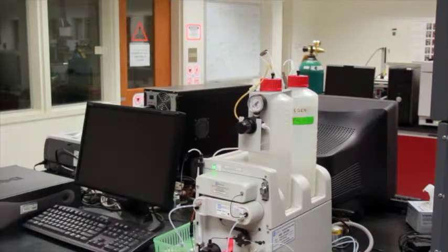When we're getting the instrument ready and getting it started, you want to make sure that you prime the pump. There are two knobs on the IC. One that is covered with red tape that adjusts the pressure. Please do not touch that knob, otherwise all the tubes and lines will be popping off at you, and it's not very fun to have eluent shooting all over the place.